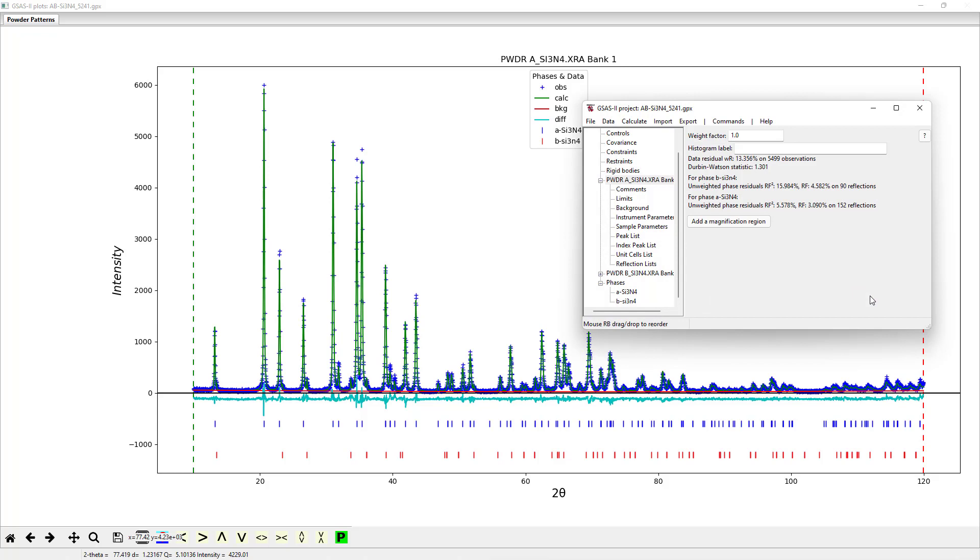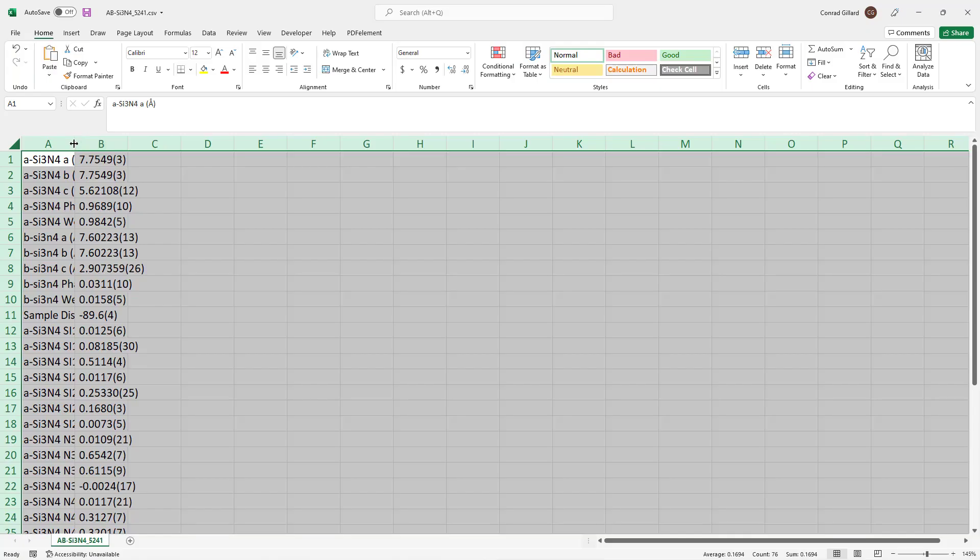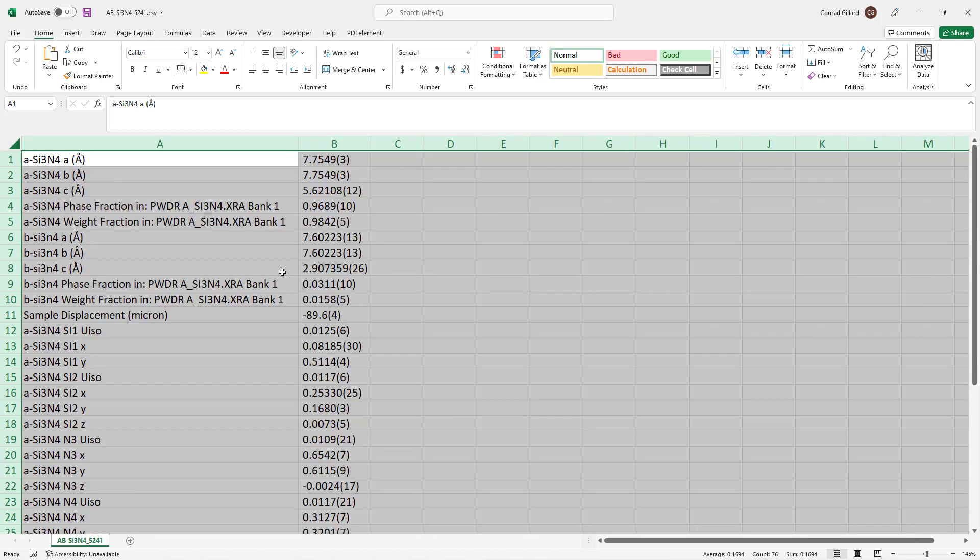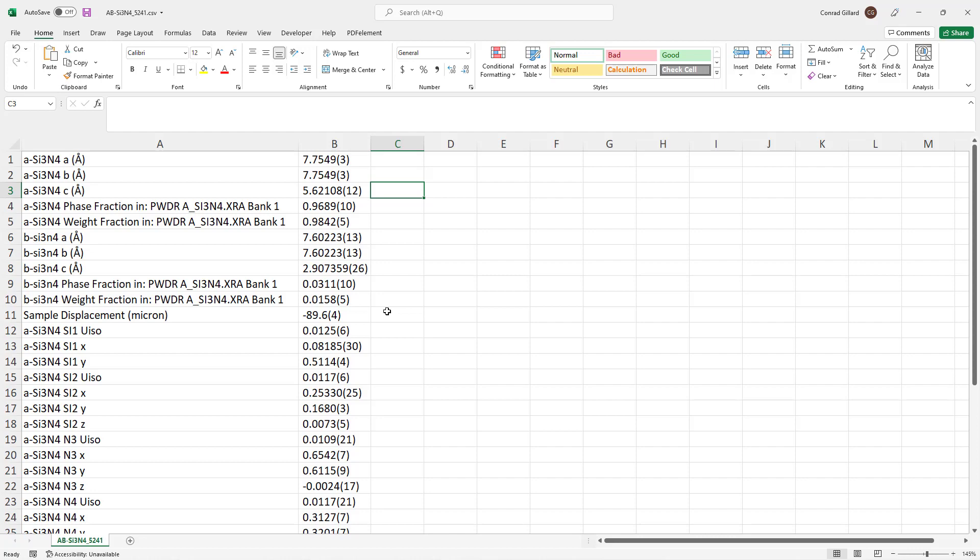The resultant file may then be opened by programs such as Excel. The commonly reported model parameters are exported, including lattice parameters, phase fractions, weight fractions, sample displacements, atomic positions, and others.